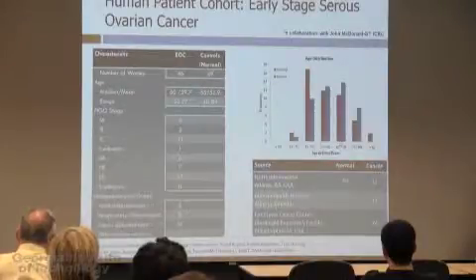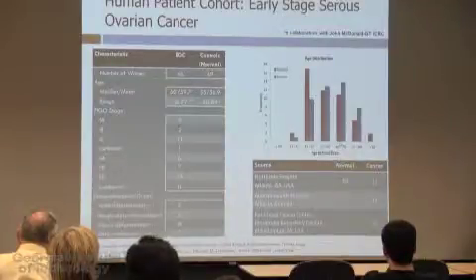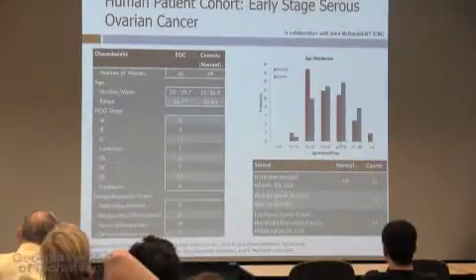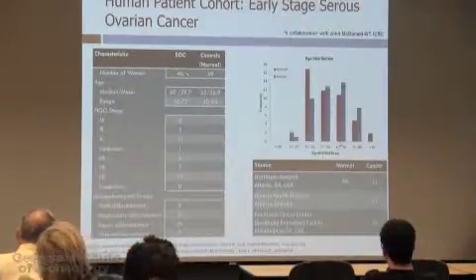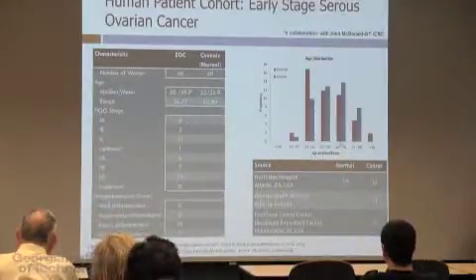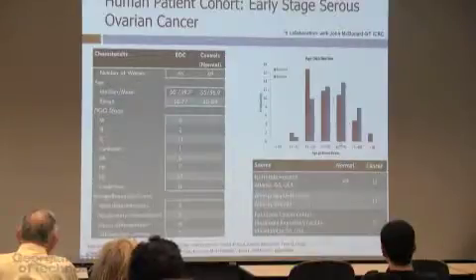So the challenge is to obtain enough samples so the study has enough power to be believable, okay? Because nobody finds early stage ovarian cancer. So we have been collecting early stage samples for a while, and here you see the largest data set so far, and the paper got accepted this morning actually. We have had about 46 early stage samples, and we age match them to controls. They have to be age matched so you don't distinguish by age. And these are the details in case you're interested, but they're all stage 1 and 2, meaning that it has not metastasized. So this is early stage.